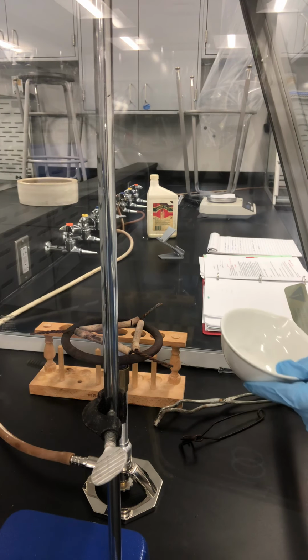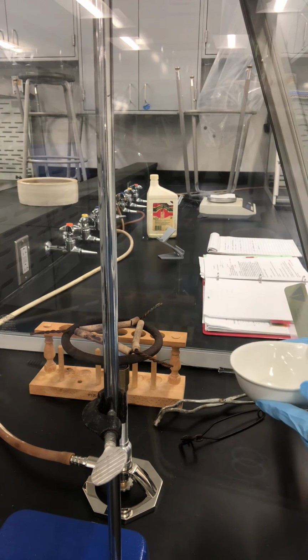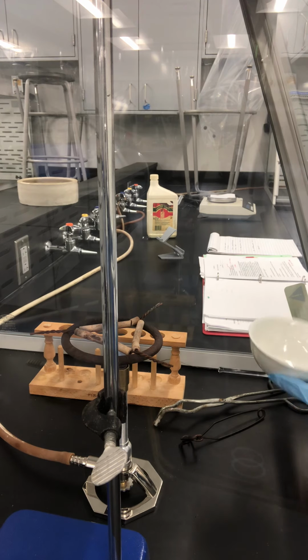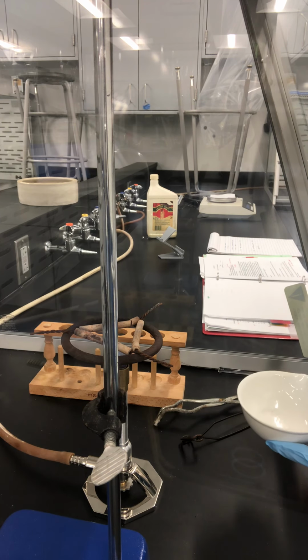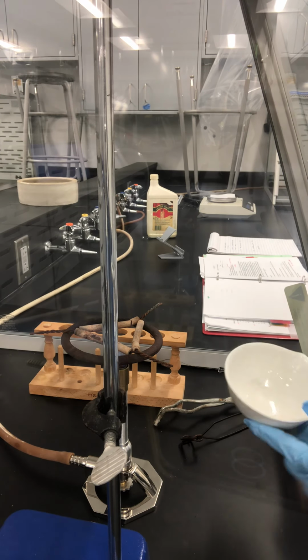Now I need to add about 10 gram of the lubricant oil. When I measure that, it doesn't have to be exactly 10 gram, it's around 10 gram. But you need to know exactly the mass of the oil. It can be 9.7 or 10.2 gram, it's all okay, but you have to know it's 9.7 or 10.2, okay?